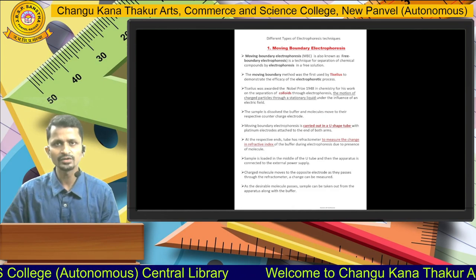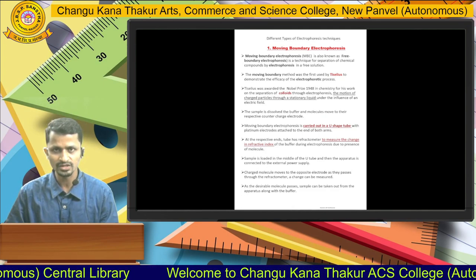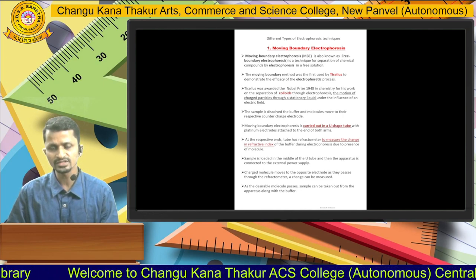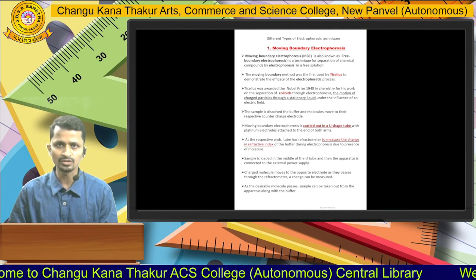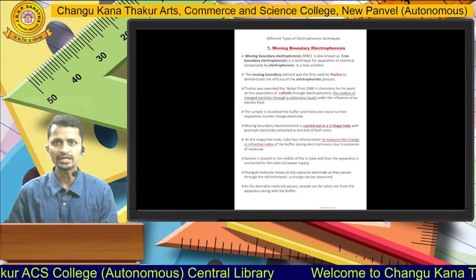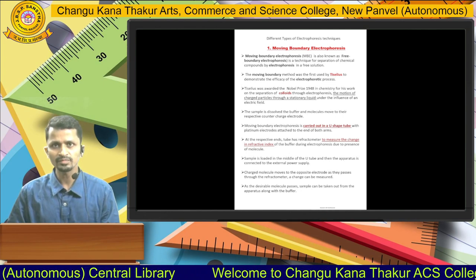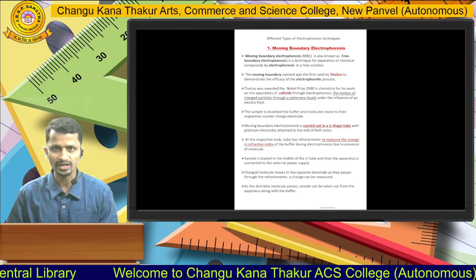So here we have to learn the different types of electrophoresis techniques. So dear students, in the previous lecture we learned what electrophoresis is. This is the technique where the separation of charged molecules takes place by supplying voltage or electricity. So here we have to learn the different types of electrophoresis techniques. The first type is moving boundary electrophoresis.